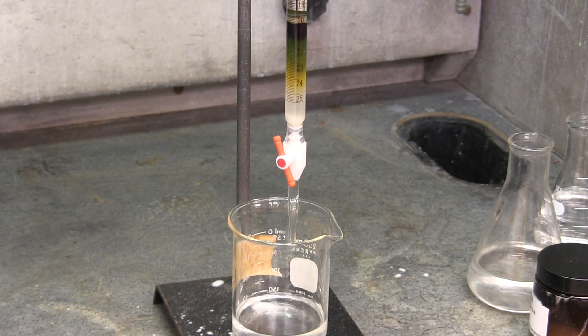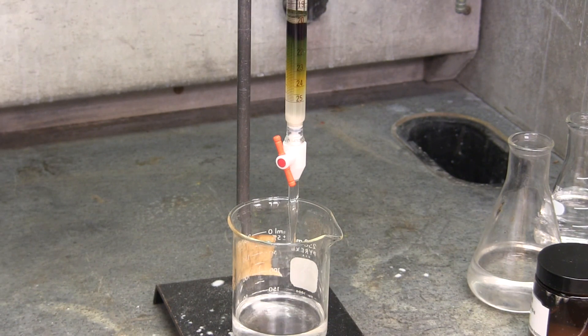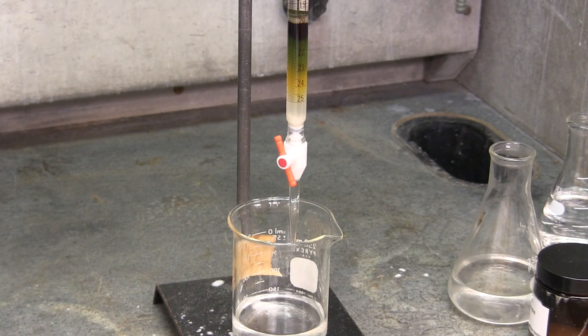We can see that the yellow band is starting to move further down than the dark green band. This will be the first fraction collected. Keep adding the 100% hexanes.